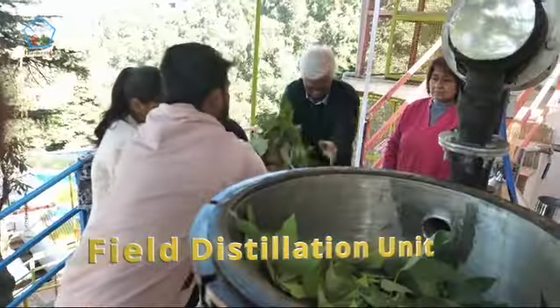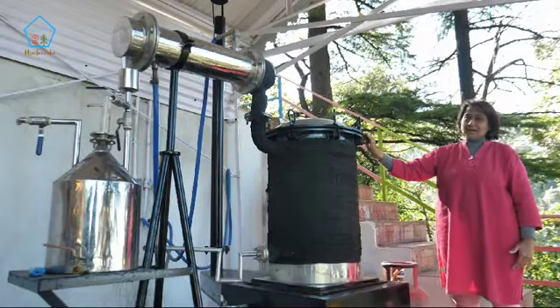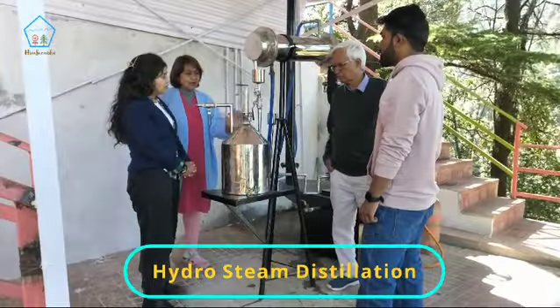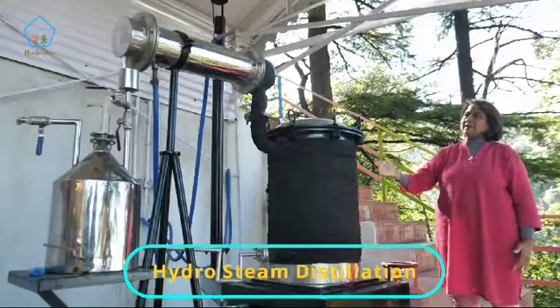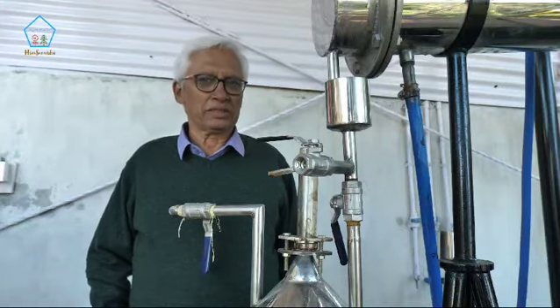I'm here to explain to you how this distillation unit works. Distillation, which is a hydro steam distillation — how it functions, what's the science behind it, what's the technique. I'm Ravinder Marwa and I'm going to explain the process here.